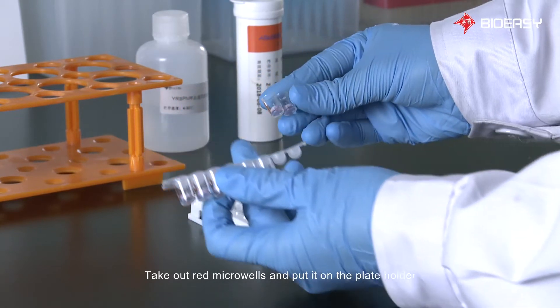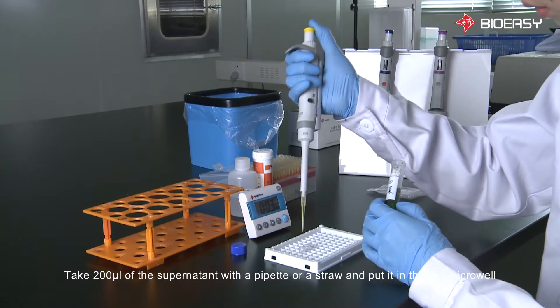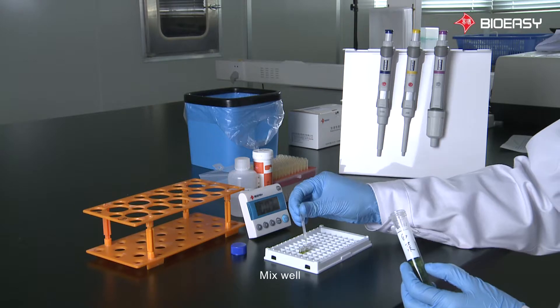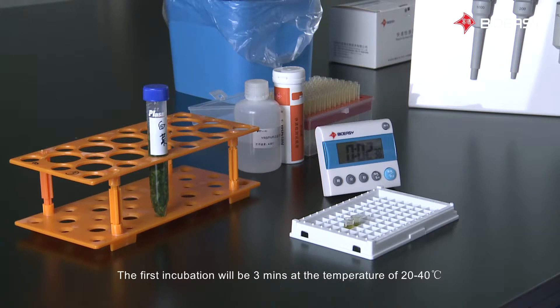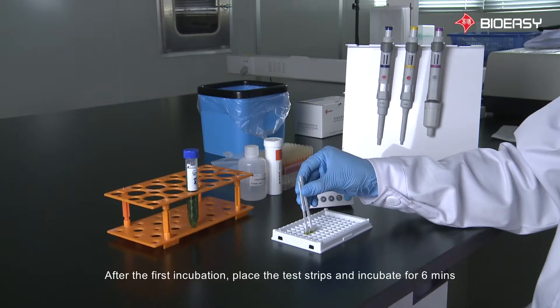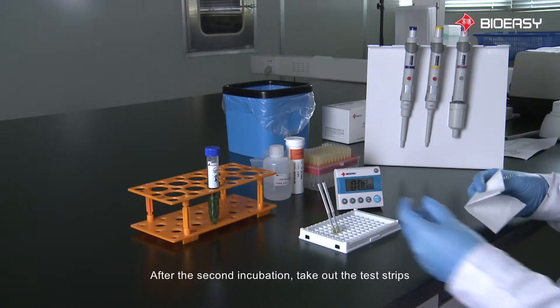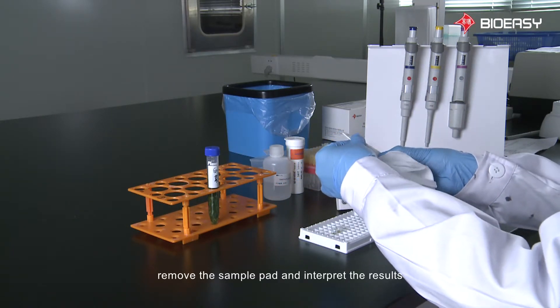Take out the red microwells and put them on the plate holder. Take 200 microliters of the supernatant with a pipette or a straw and put it in the red microwell. Mix well. The first incubation will be three minutes at a temperature of 20 to 40 degrees Celsius. After the first incubation, place the test strips and incubate for six minutes. After the second incubation, take out the test strips, remove the sample pad, and interpret the results.